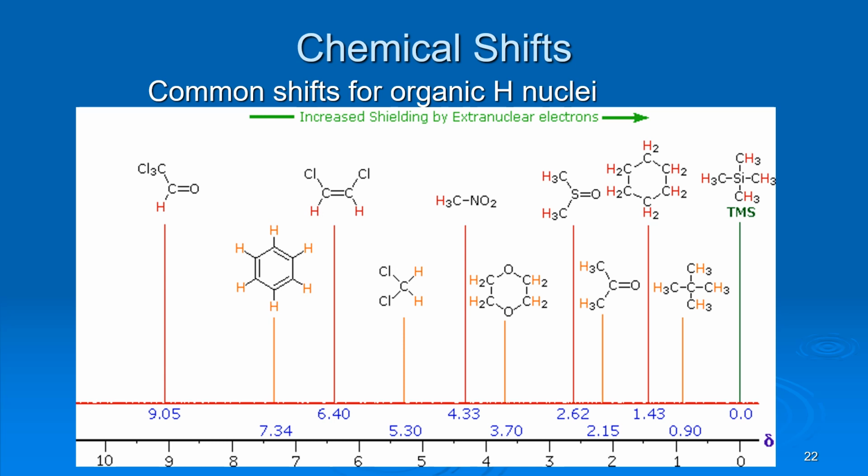Same thing here. Now here, the carbon where the hydrogens are attached is directly attached to an O, which is an electron withdrawing element. So these hydrogens are at an even higher number, which is more de-shielded. Here's a nitro group, which is very de-shielding. And so you can see here that the hydrogens in red are even further de-shielded. Here's the hydrogen on a carbon that's also got some chlorine, so halogens are also very de-shielding.